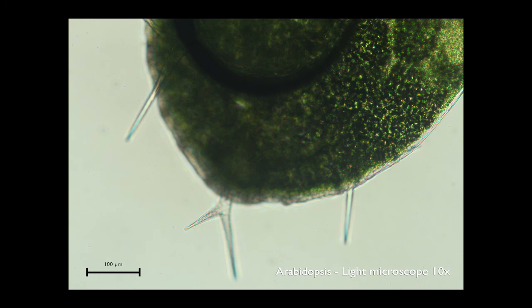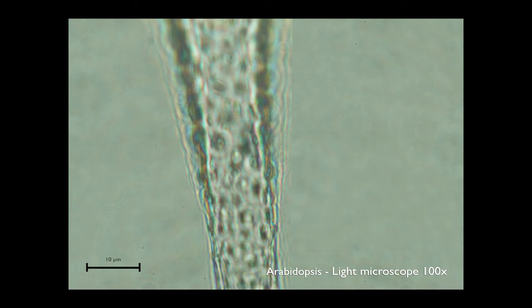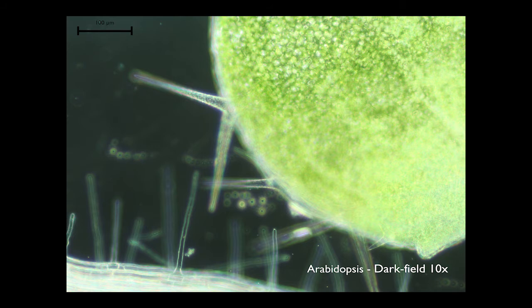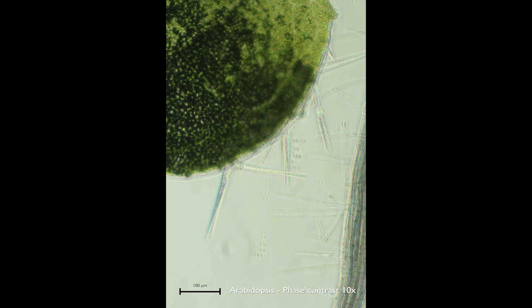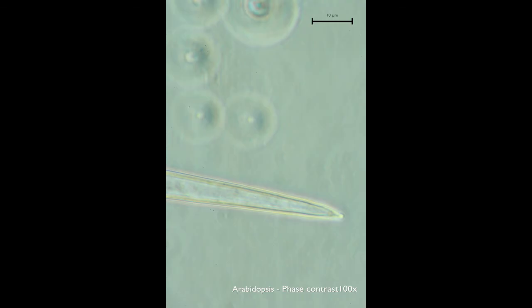Here we have the images immediately following the 5-day growth period. Shoot epidermal hairs are known as trichomes, a term that is derived from the Greek word trichos for hairs. Trichomes are found in most plants and can comprise either single or several cells and can be secretory, glandular, or non-glandular. The functions that are ascribed to trichomes range from protecting the plant against insect herbivores and UV light, to reducing transpiration and increasing tolerance to freezing.